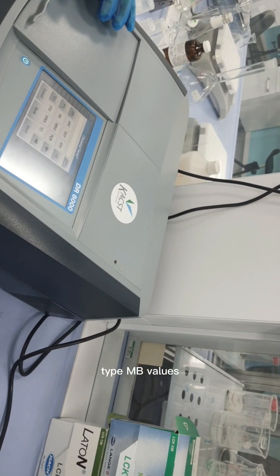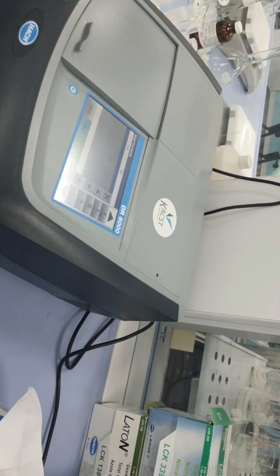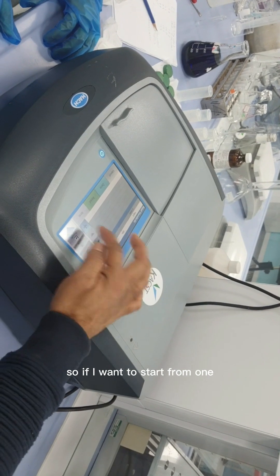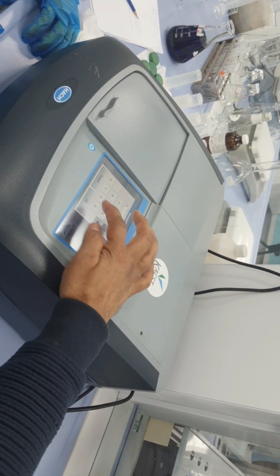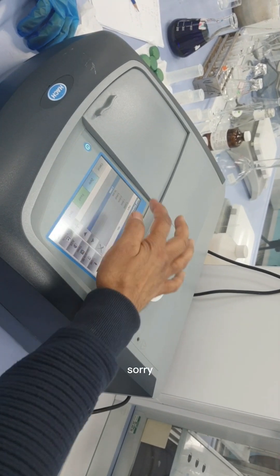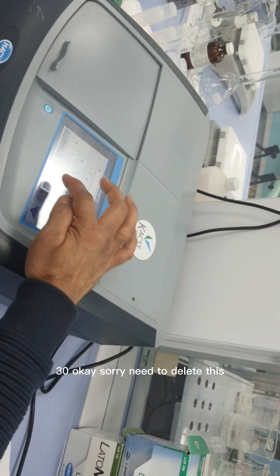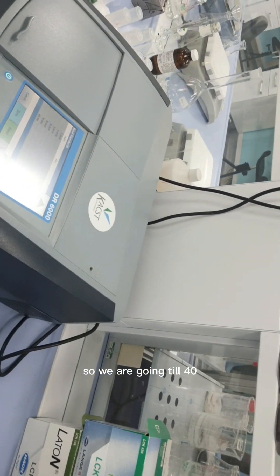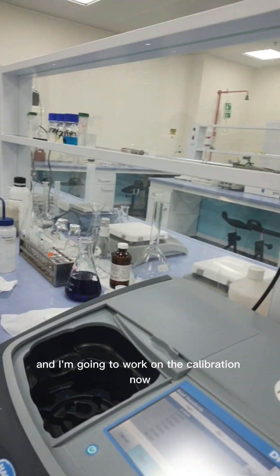You can type the chemical name as 'methylene blue' or just 'MB'. Select 'Read Standards' and press Next. Now enter the standard concentrations: start with zero for the blank, then add 1, 2, 5, 10, 20, 30, and 40 ppm. We are calibrating up to 40 ppm.